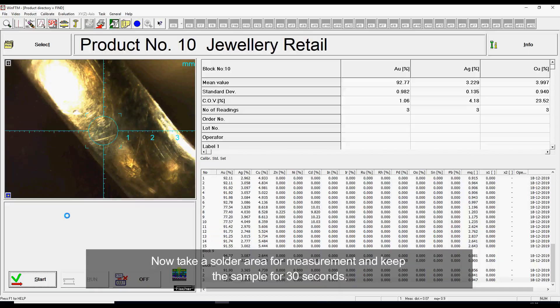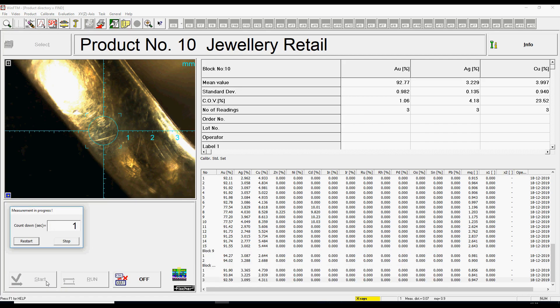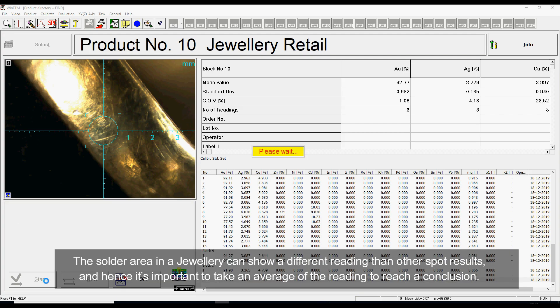Now take a solder area for measurement and keep the sample for 30 seconds. The solder area in a jewelry piece can show a different reading than other spot results, and hence it's important to take an average of the readings to reach a conclusion.